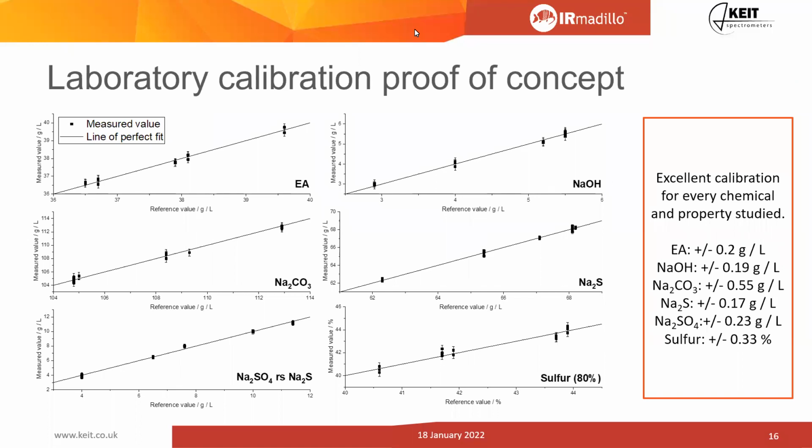All righty, thank you. Let's see here. Next question. Do you have a standard solution of sticky suspension in order for you to calibrate the instrument?